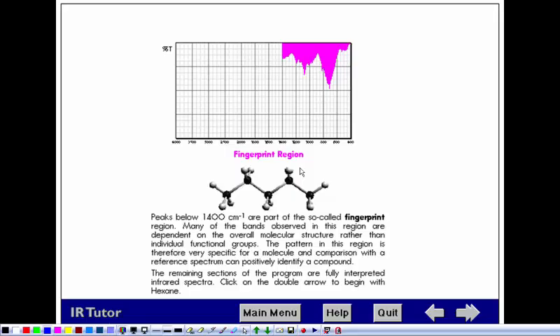That was easy enough: just grab a handful of green stuff from the field, put it on the infrared, and determine whether it looked like polyethylene or nylon. Basically, if there was a carbonyl, it would be nylon. If there's no carbonyl, polyethylene. Plus, I took a Ziploc baggie, which is polyethylene, and compared it, and it was fine. So it's not full of lead.